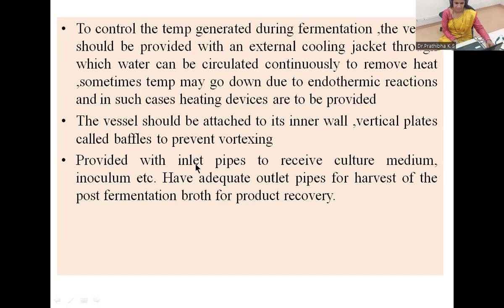And further, the inlet pipes to receive the culture medium. Apart from baffles, apart from temperature regulation, cooling jackets and the heating coil, there you can also see some inlet pipes to receive the culture medium. For example, during the culturing process or bioprocess, if the nutrients are exhausted already, so still microorganisms are there. If they need nutrients, there must be inlet pipes to receive the culture medium, right?